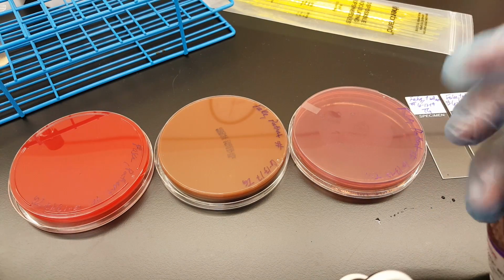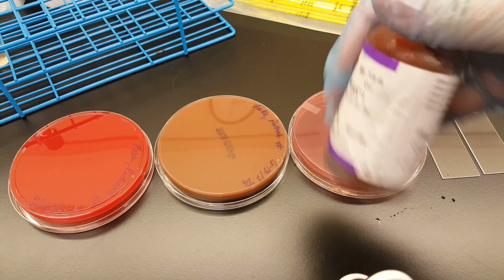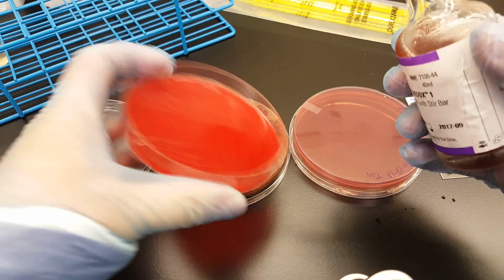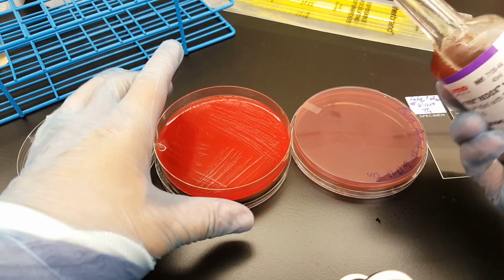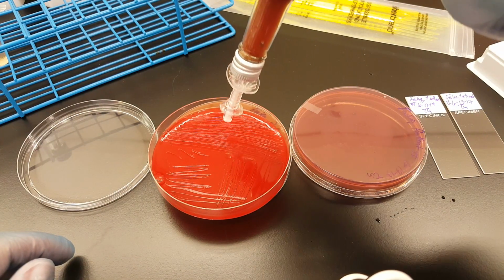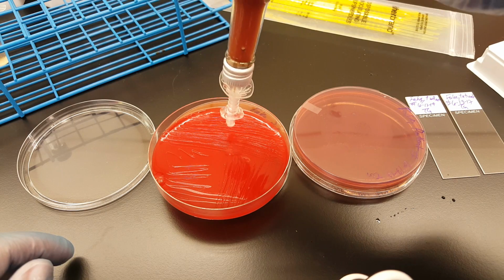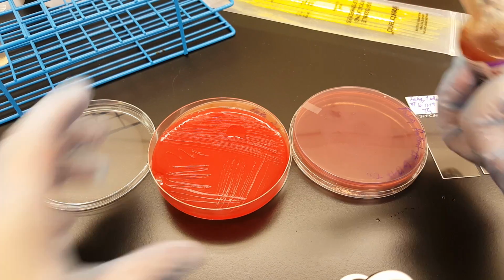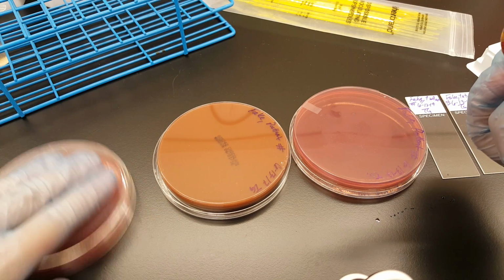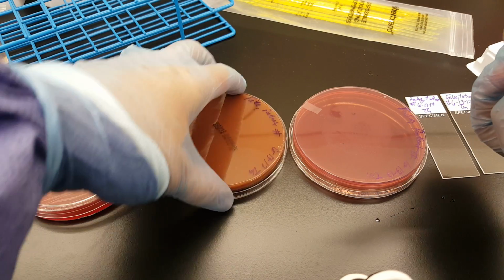I'm going to take the cap off, okay? Mix it a little bit by swirling. And I'm going to turn this over. I already streaked one before in another video. That's why it looks like that. So it's going to come out. 1 drop is all you need. Okay, and I'm going to leave it facing up so that I don't lose my specimen.